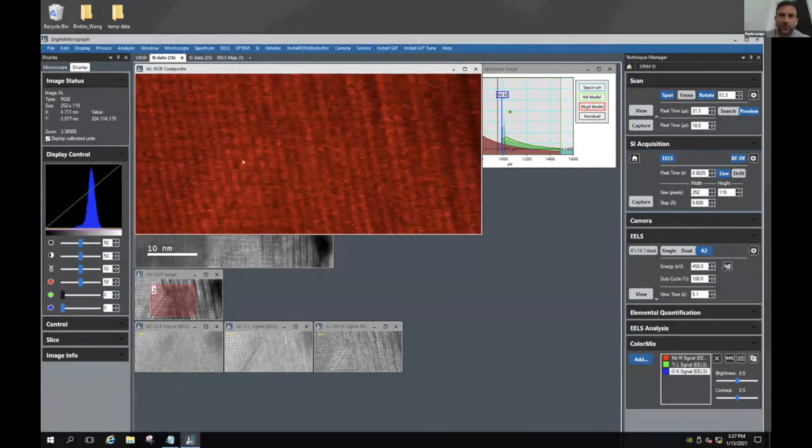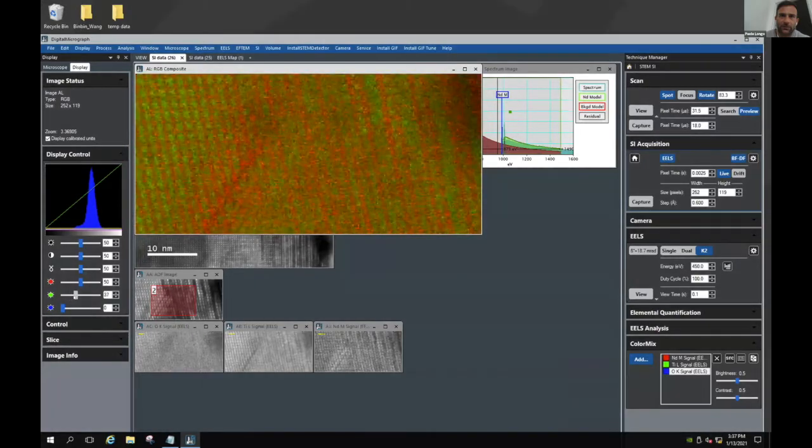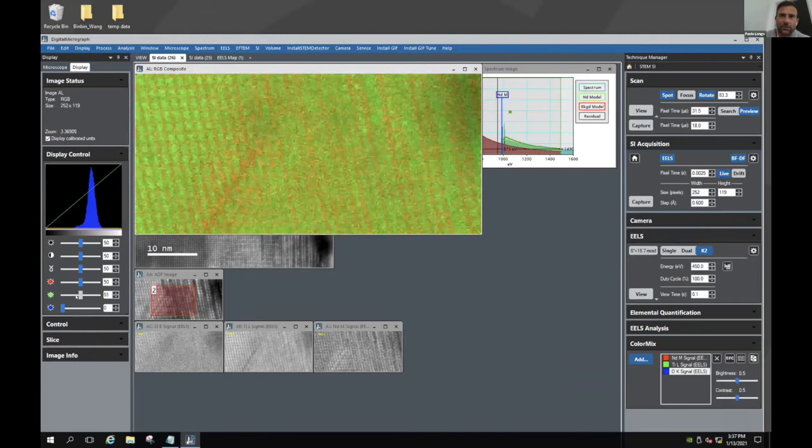Now you see all this region here. The diagonal region here is actually made of neodymium. And then you start to get the oxygen in there. Look, sorry, the titanium, look where the titanium is sitting. You see, this area is a little bit off axis. That's why the atomic structure doesn't look very nice. But you can clearly see the region here.